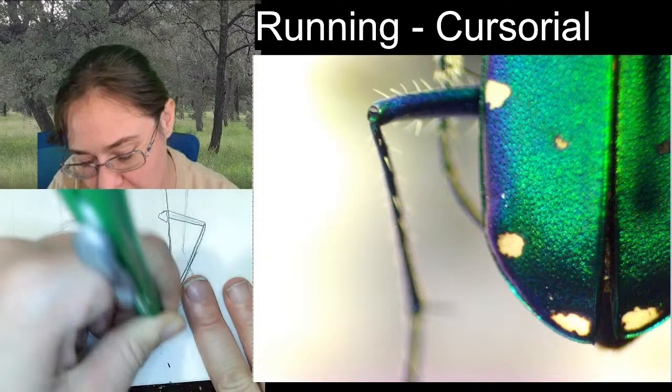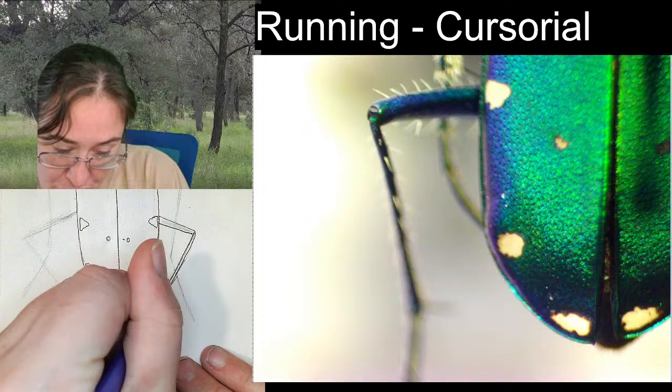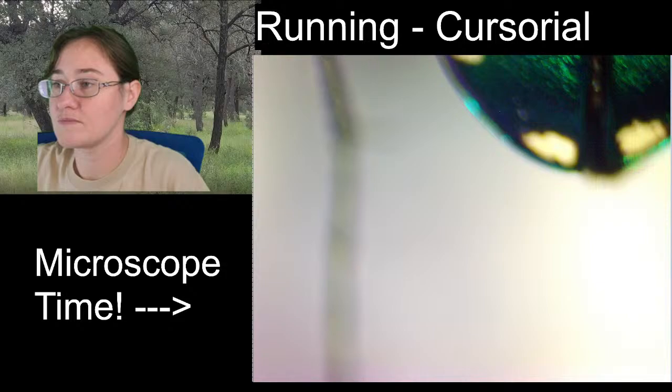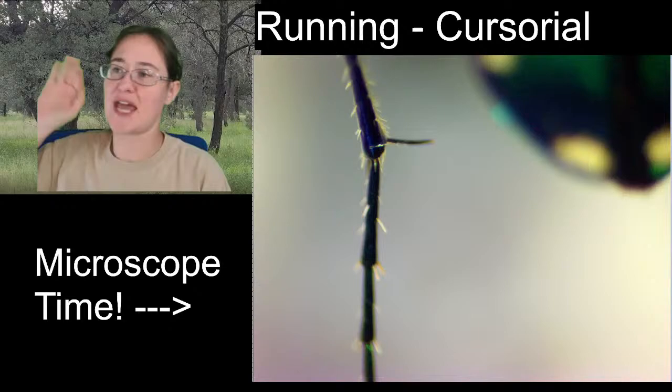So I'm going to put my tibia to come right, till right about here. And our tibia does have two tibial spurs. We can only really see one tibial spur from this angle. I promise there are two there. Let's go ahead and focus down. So there's the one tibial spur up there at the top, and then the other tibial spur is actually directly away from us.